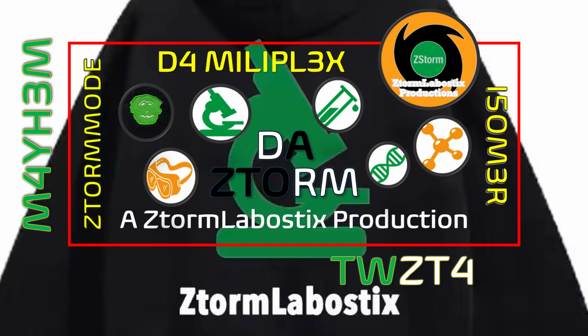This audio podcast is looking at Oxford Nanopore sequencing technology's involvement in the genomic domain and its impact in the biomedical science field. This overview draws on some fantastic work that has been articulated by a science student, Heidi Stefan, at one of the academic institutions in the southwest UK.